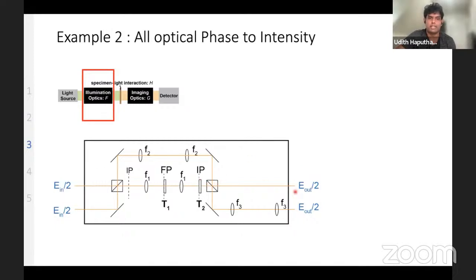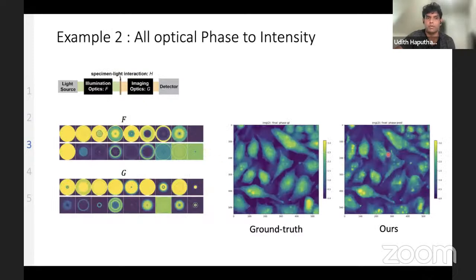For this case, we use this type of setup, which is slightly more advanced than the previous one because it has skip connections, which act similarly to skip connections in ResNets and other computation modes. So these are the results we obtained. Currently we couldn't explain the filters, but these are our results. At this point it is not that quantitative.